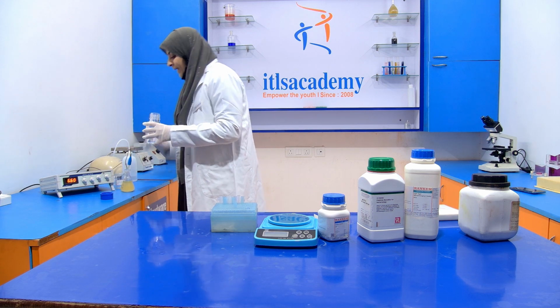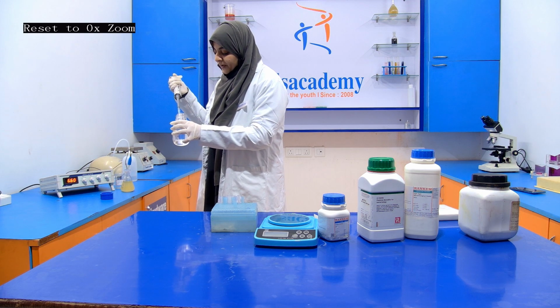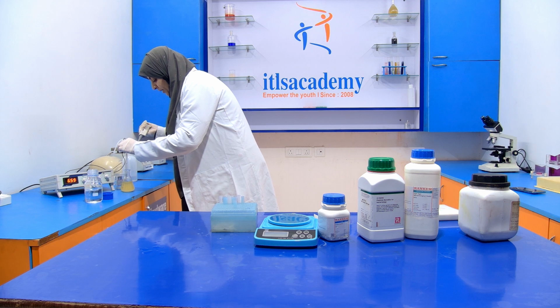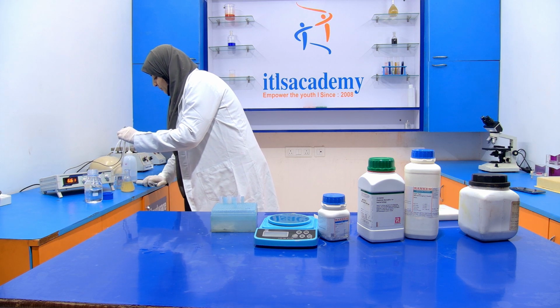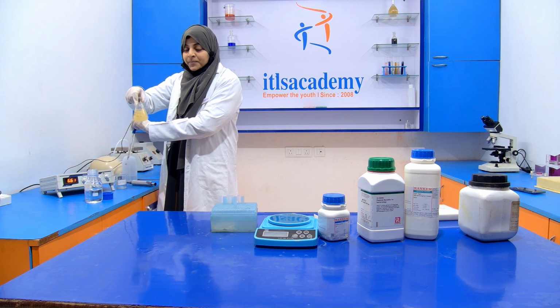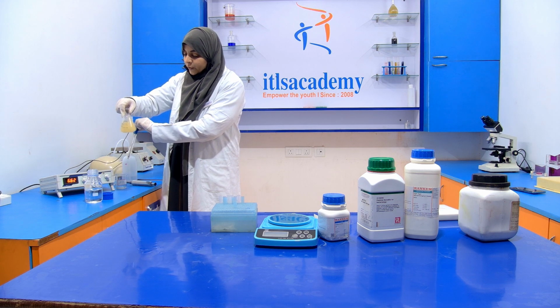You have to add NaOH very slowly, otherwise its pH will overshoot. So I am going to add 2 to 3 drops of NaOH into it and mix it properly. After mixing it, I am going to take the pH with the help of the electrode.